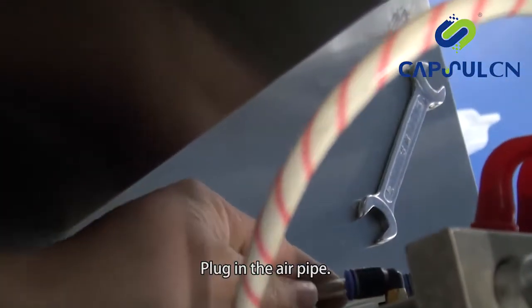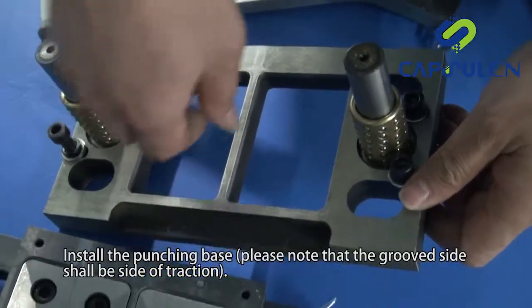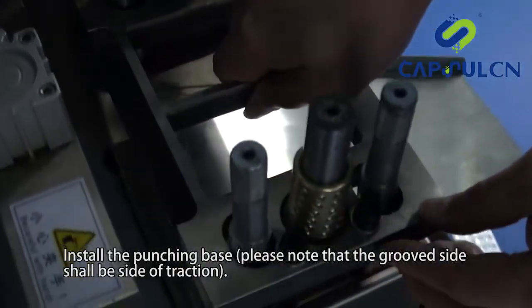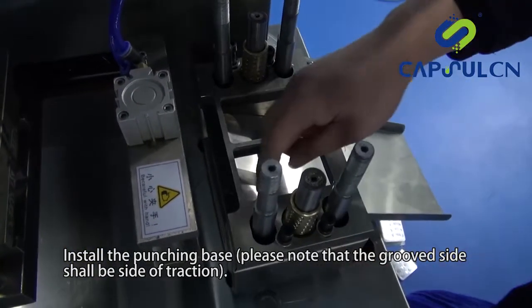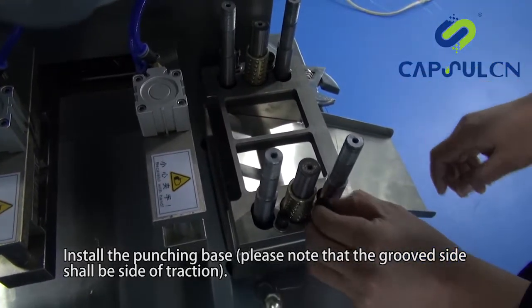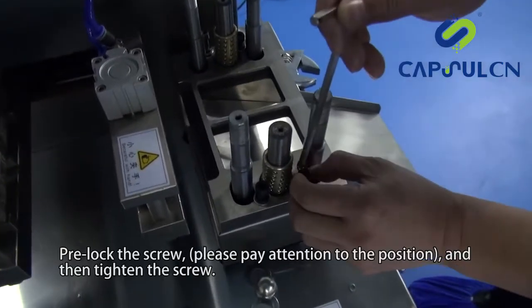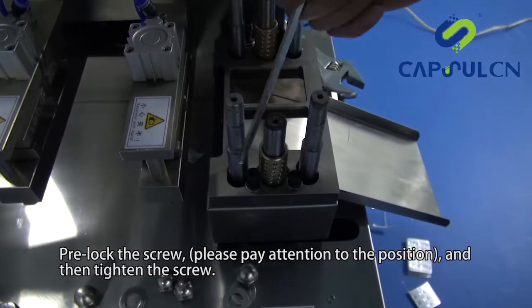Plug in the air pipe. Install the punching base — please note that the grooved side shall be the side of traction. Pre-lock the screw, please pay attention to the position, and then tighten the screw.